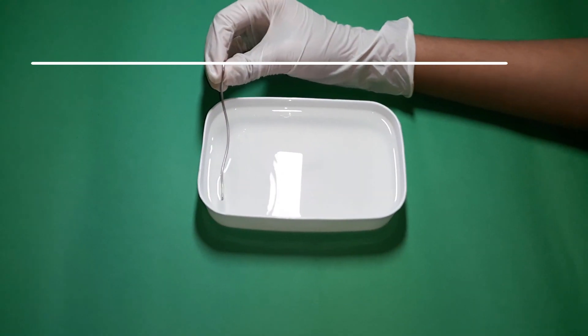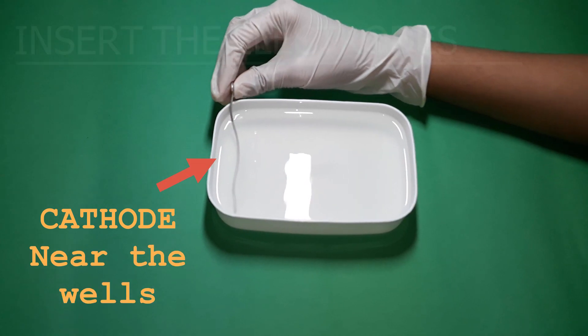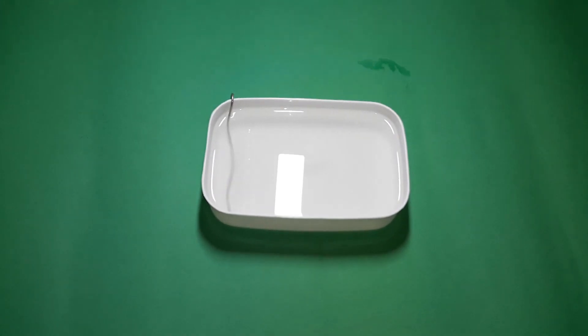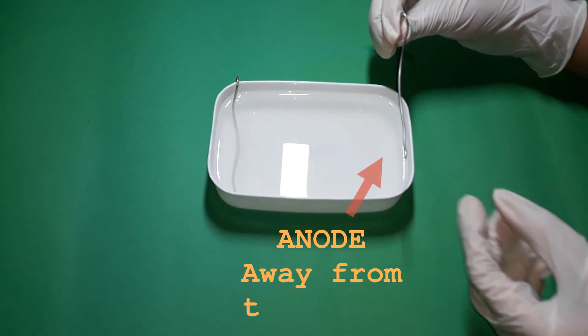It's time to insert the electrodes. Insert the negative electrode or cathode at the end nearby the wells and insert the positive electrode or anode at the end away from the wells.